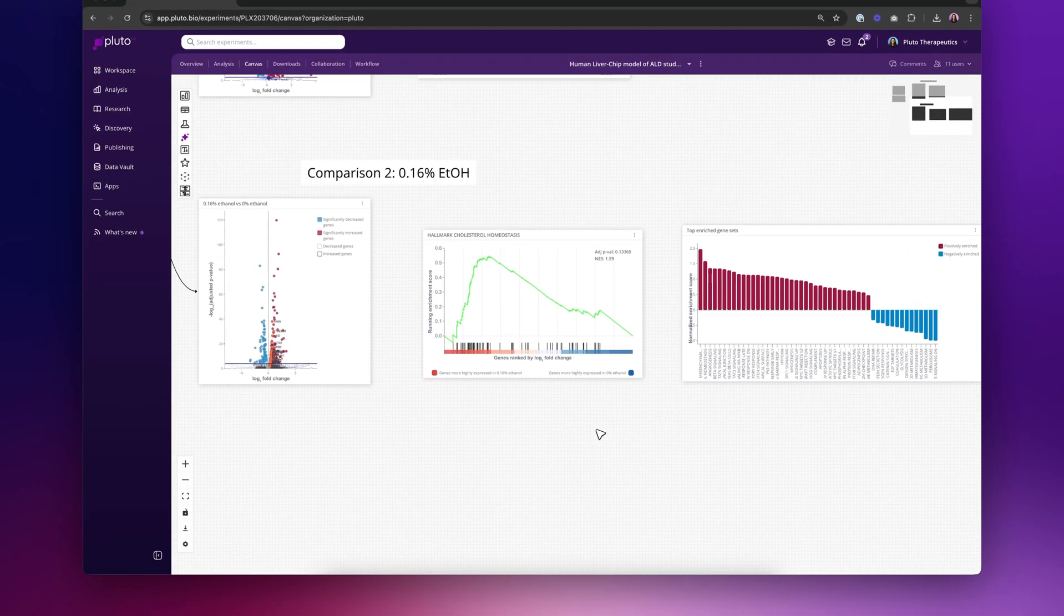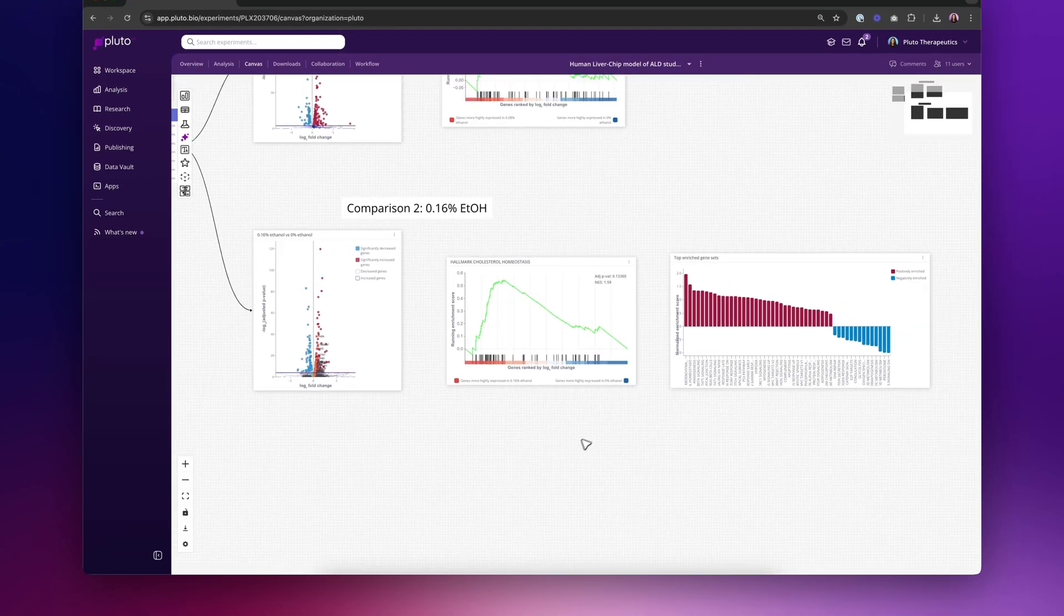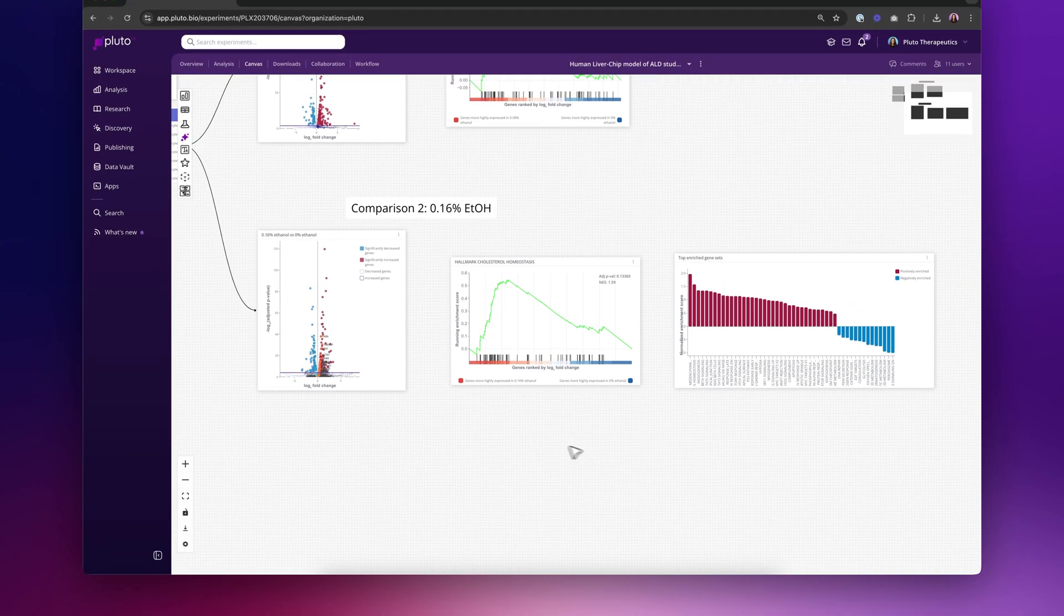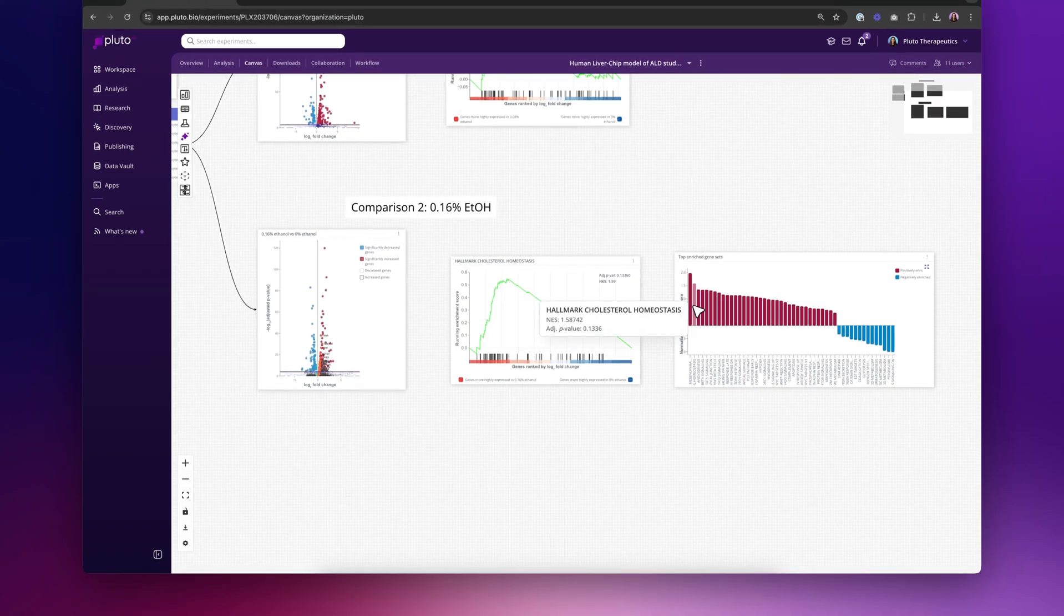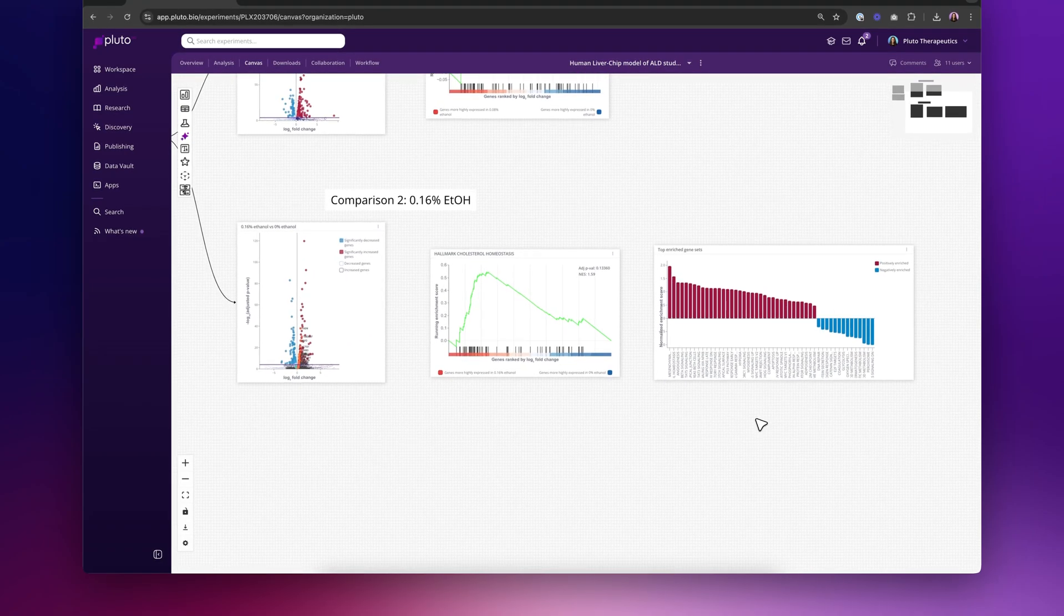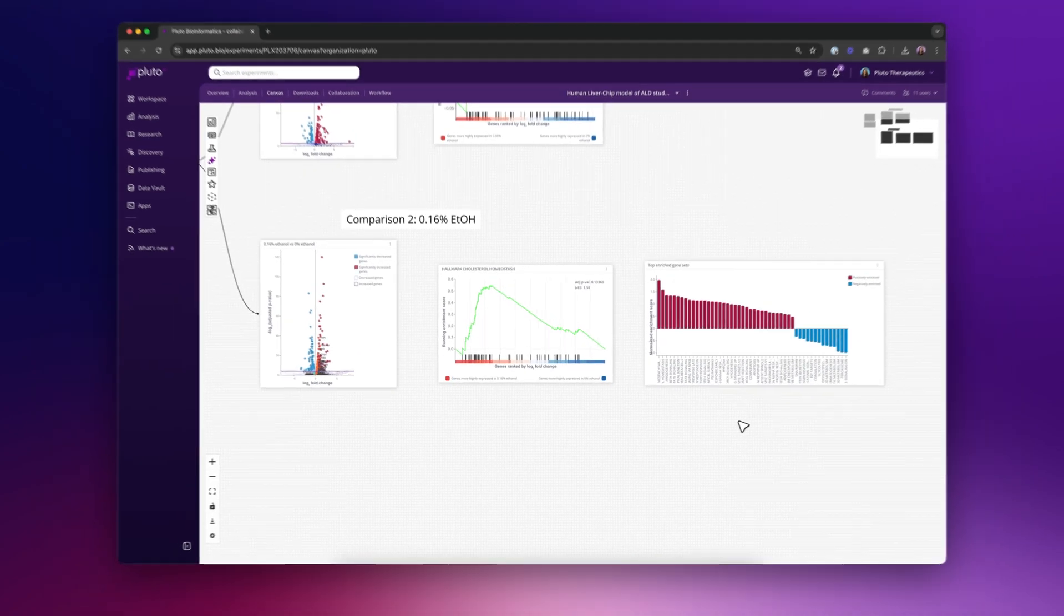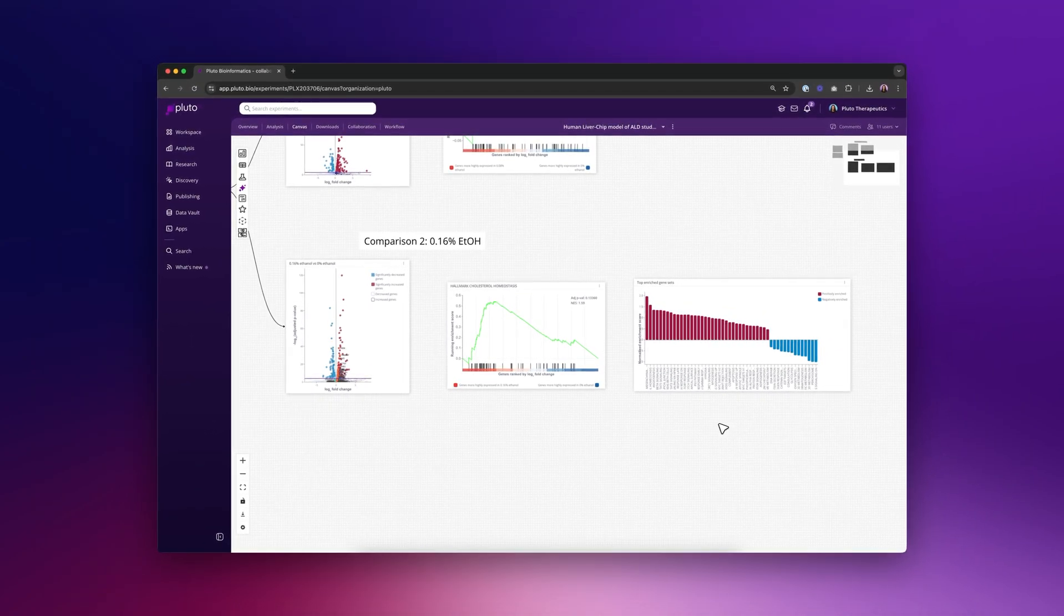So that was a basic introduction to gene set enrichment analysis and how we go from a differential expression result here into two different kinds of visualizations from the GSEA algorithm. Thanks so much for watching.